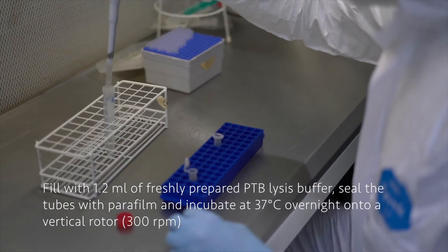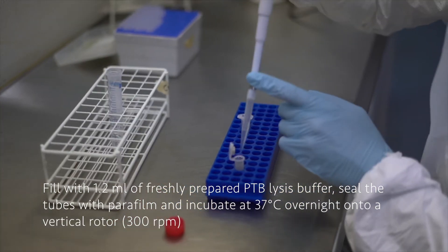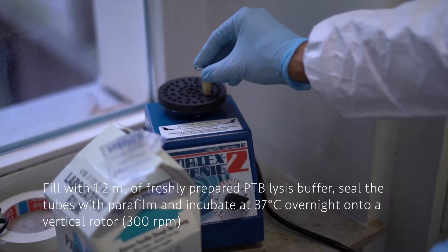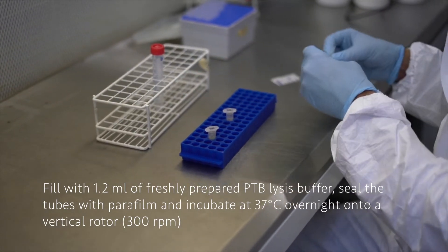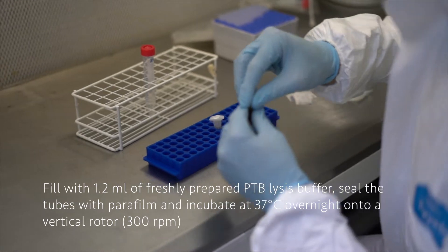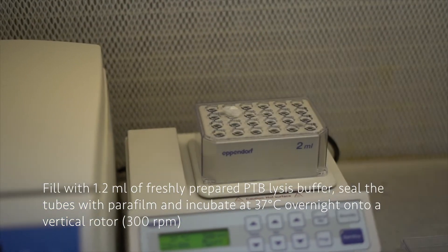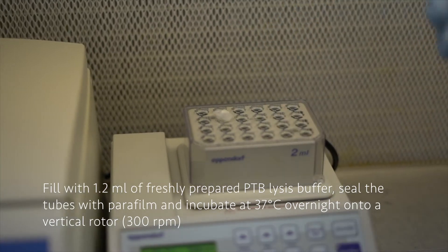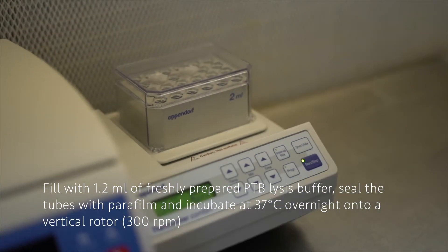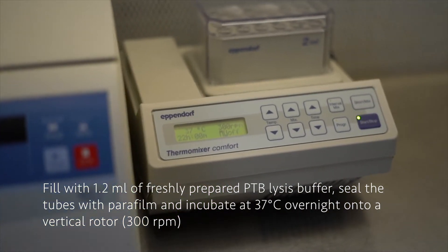Now we are going to place 1.2 milliliters of the freshly prepared PTB-DTT buffer on the samples. I'm going to vortex them shortly, then we are going to seal the tubes with parafilm and put them onto the thermoblock. The thermoblock is already set at 37 degrees and once we are ready we can activate it so that it's rotating at 300 rpm. We are going to leave it incubating overnight.